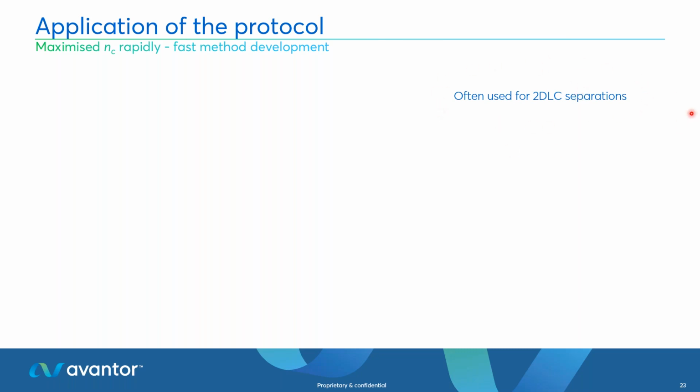And I'm just going to highlight from Professor Peter Carr's group, I think many chromatographers know Dwight Stoll is really flagshipping and championing 2DLC separations. So I had readily accessible to me very complex samples that I used for 2DLC separations. So I used that for this decision tree of separations for a 1DLC approach.